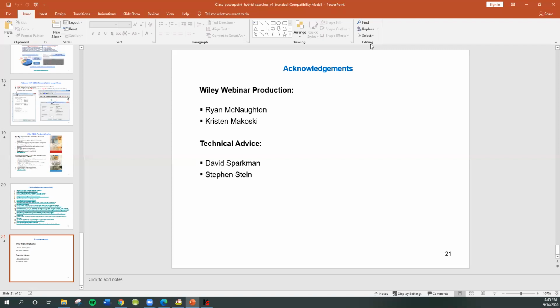We like to use ammonia as our gas. And you think, well, ammonia, that's not really a good choice. That's pretty nasty stuff, isn't it? Well, yes and no. If you open it and take a whiff of it up your nose, it's pretty nasty stuff. But if you keep it contained like it should be, and you run chemical ionization, if you use isobutane as your reagent gas, you get a lot of hydrocarbon buildup.